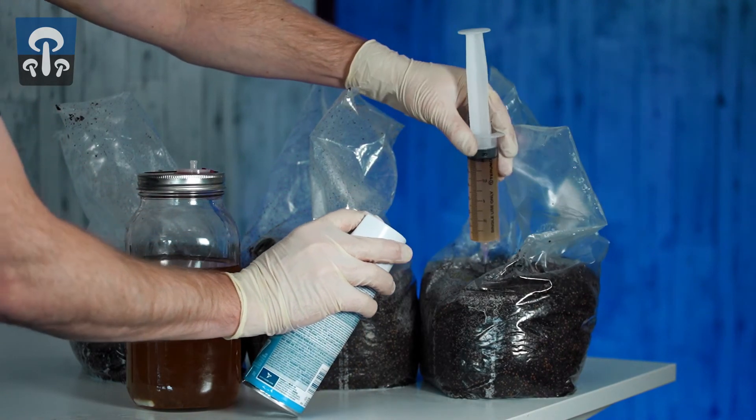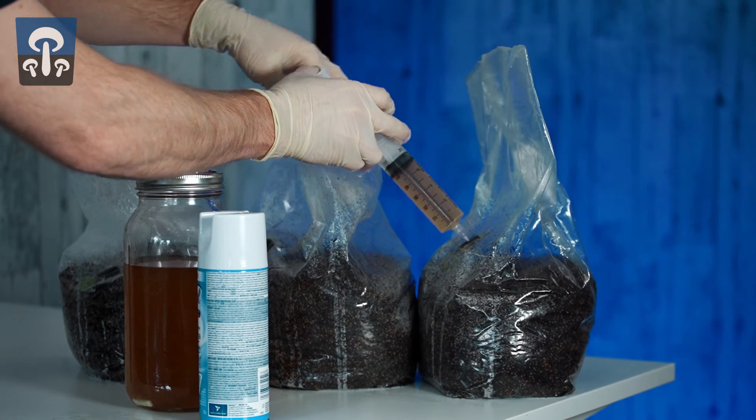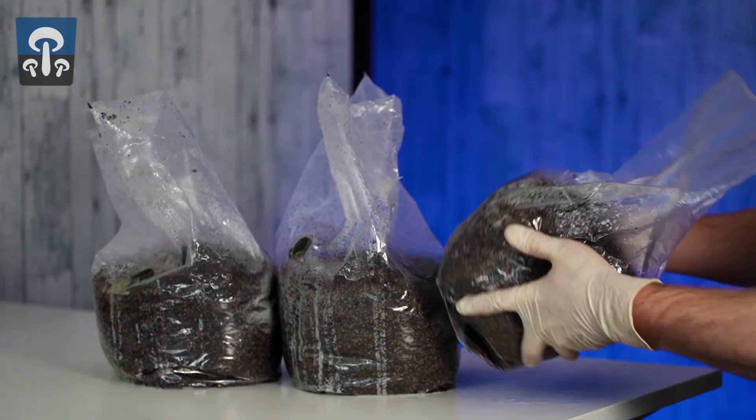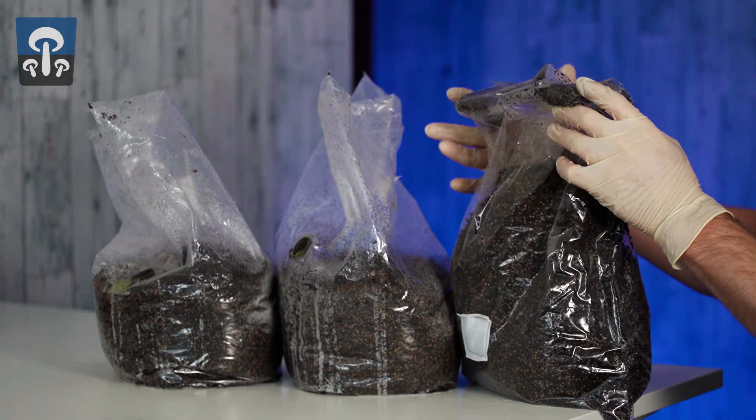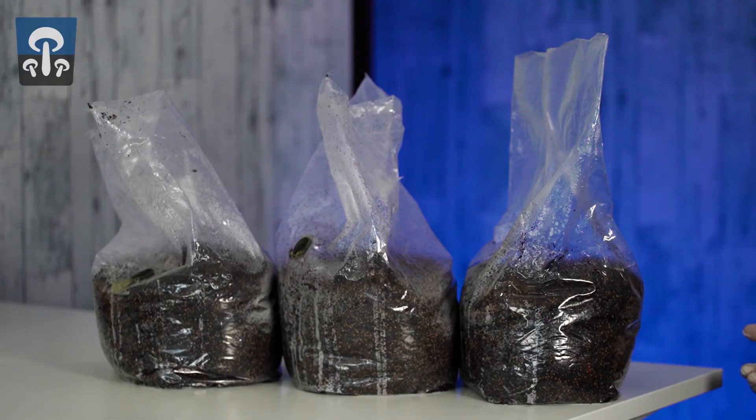It will work with as little as 3 milliliters of liquid culture, but we recommend a minimum of 20 and a maximum of 60. Now mix them to disperse the mycelium throughout the bag. When you're done, place them in a warm dark place to colonize.